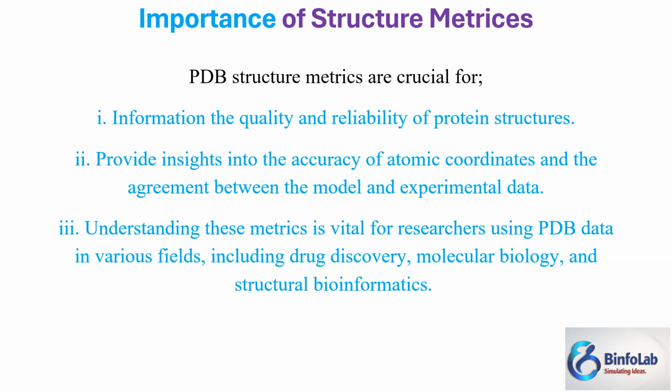But there is a possibility that due to some experimental noise, due to the data shooting, the data from the second domain, the electron density, may not be very clear. So in that case, you often see some missing residues of the loops and other regions. I don't want to go into bigger detail, but the fluctuating regions are difficult to capture successfully on the electron density map.